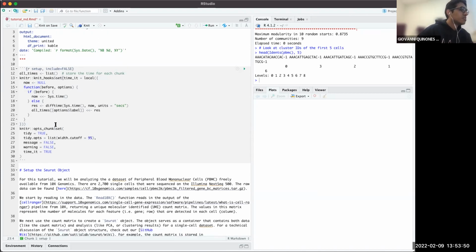Another reason why I chose this particular one is that all the steps are fairly standard. From study to study, you may want to run different types of analysis, but there are some analyses that are consistent across the board, and those are the ones that we're going to be learning today.